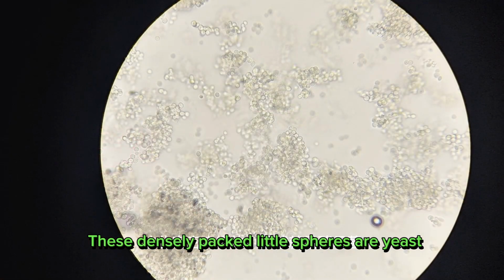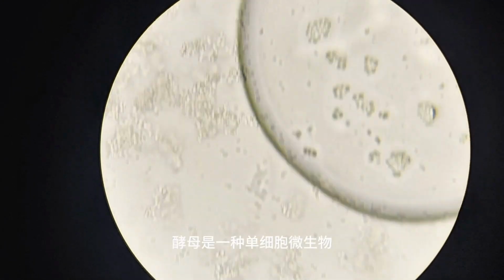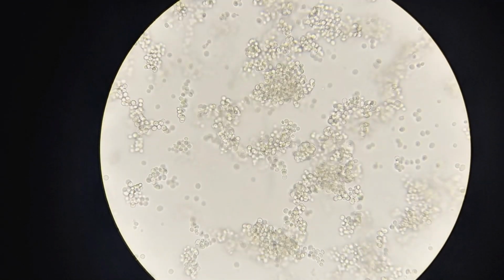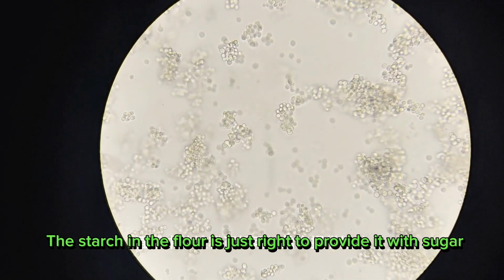These densely packed little spheres are yeast. Yeast is a single-celled microorganism. It's a fungus. It's a lot bigger than a bacterium, usually between 6 to 15 microns. It reproduces on the energy of sugar. The starch in the flour is just right to provide it with sugar.